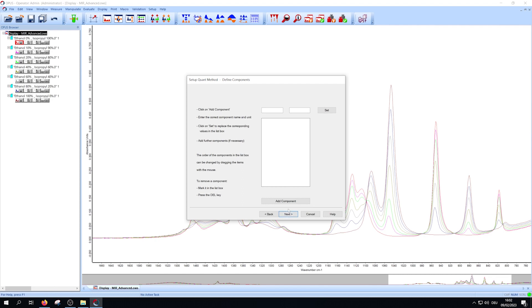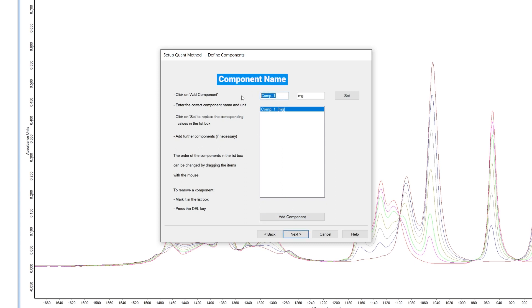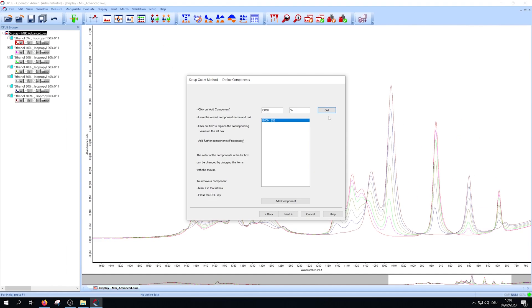In this step you have to add the component of interest. Press the add component button, write the component name in the left rectangle, and the unit in the right rectangle. Afterwards press set. Repeat this for every component and then press next.